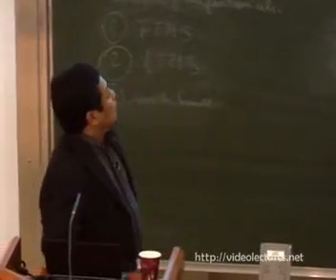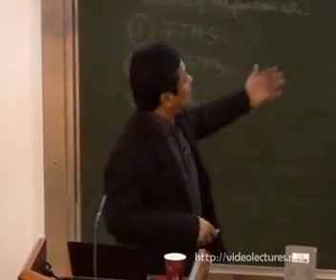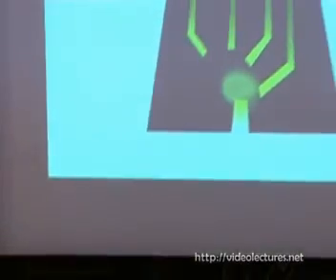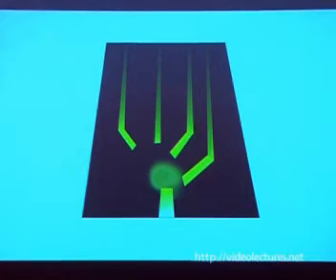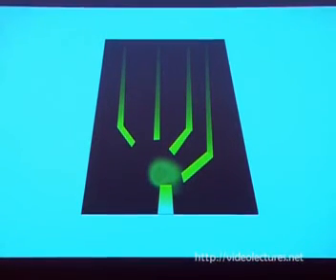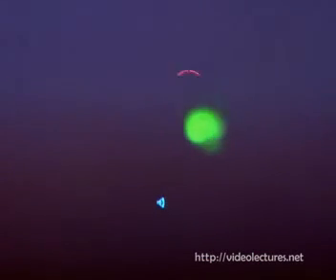So how do we use that? In the US, we need to explain everything to get grant funding. So I said, well, we can use this nano-selector switch or multiple logic. And this is quite famous because now the people in India who are vegetarians think that they're eating spinach. Now they can connect the spinach and nanotechnology. So this was also in a Paris fashion show, how we switch the single molecule of chlorophyll. These are animations of different STM images.